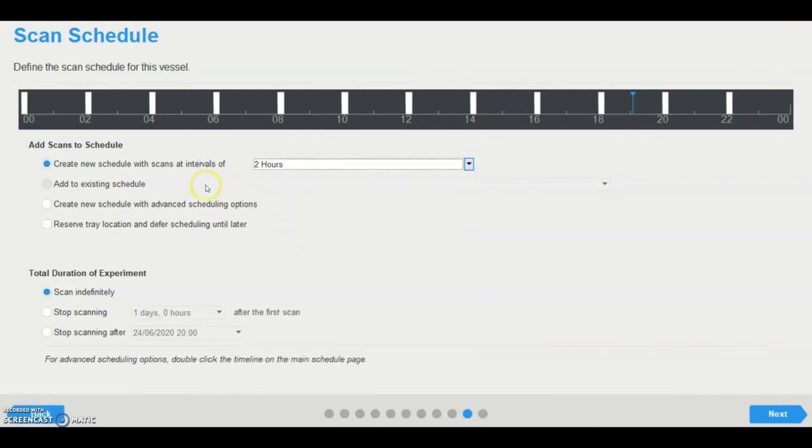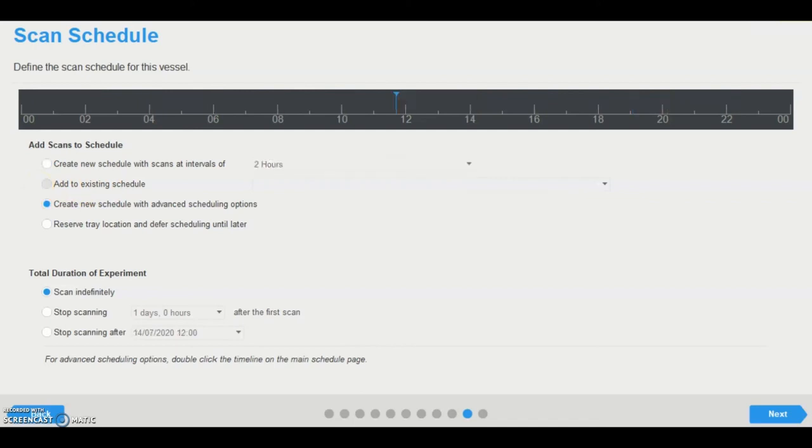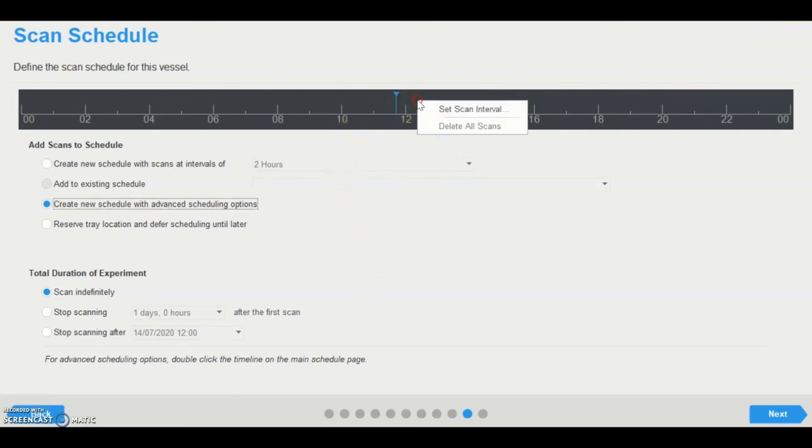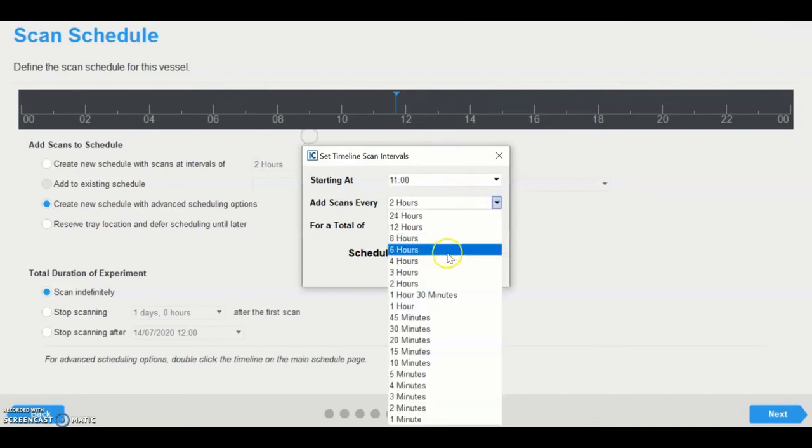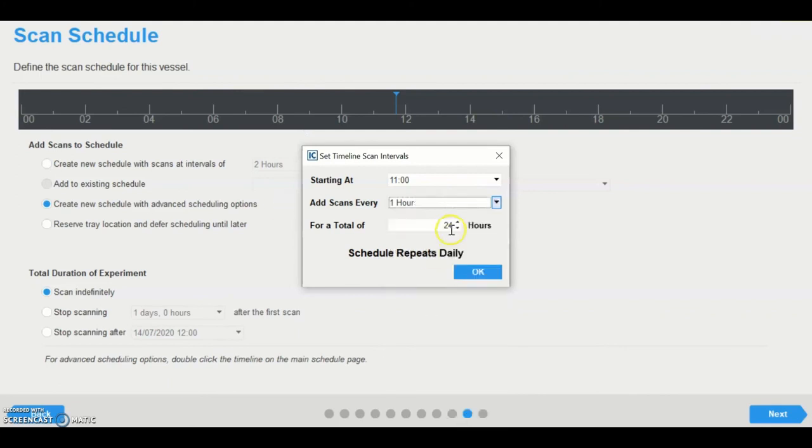Add the vessel to an existing schedule should one be present. This will group the new vessel with an existing vessel, or vessels, and each will be scanned sequentially at each defined time point. Create a new schedule with advanced scheduling options, which can be opened by right-clicking the timeline and selecting set scan interval. This allows users to define a specific start time, for example 11 AM, the scan interval, for example every hour, and the window of scanning during each 24 hour interval.